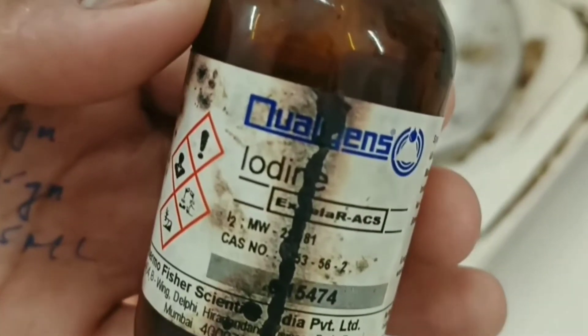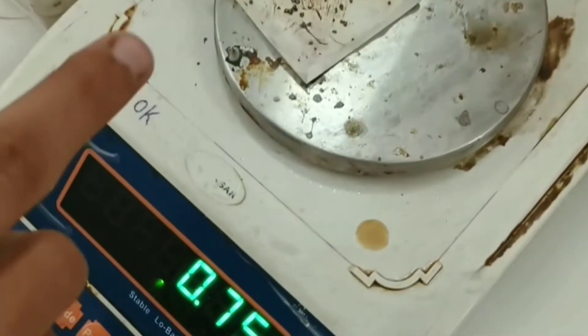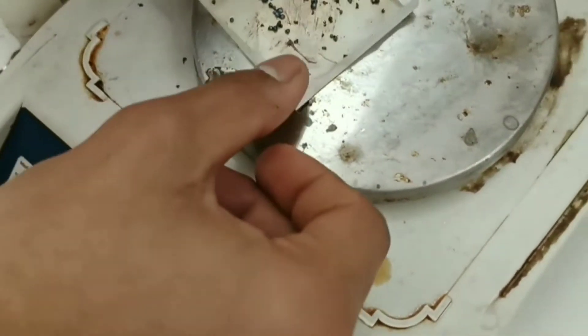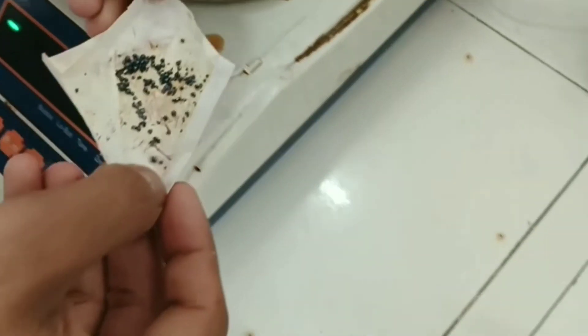Now we will take 0.75 grams of iodine and transfer it into the potassium iodide solution and mix it with a glass rod.